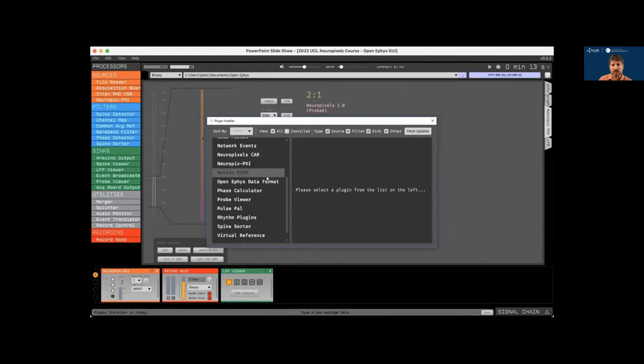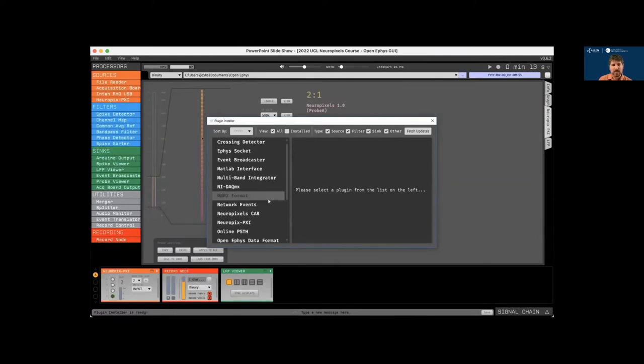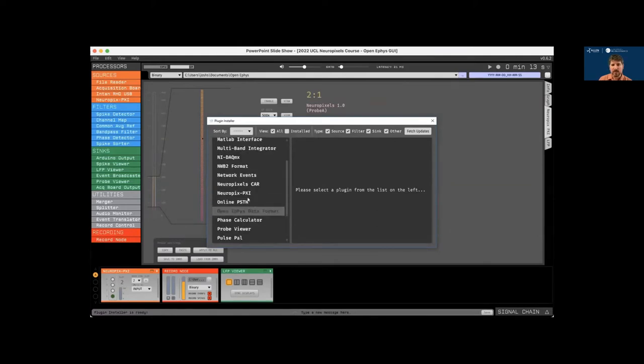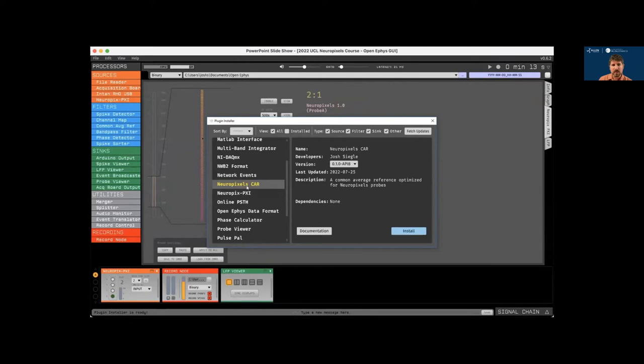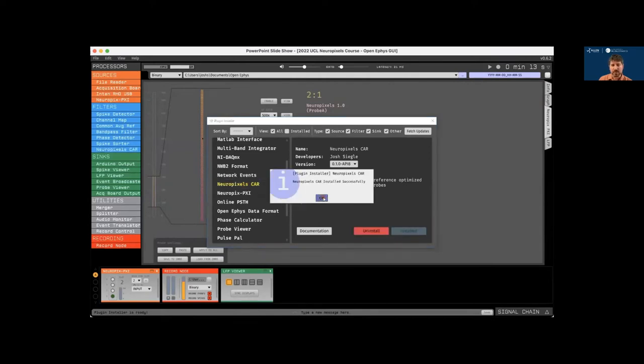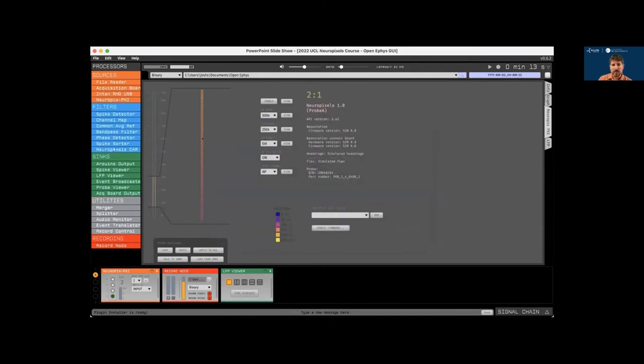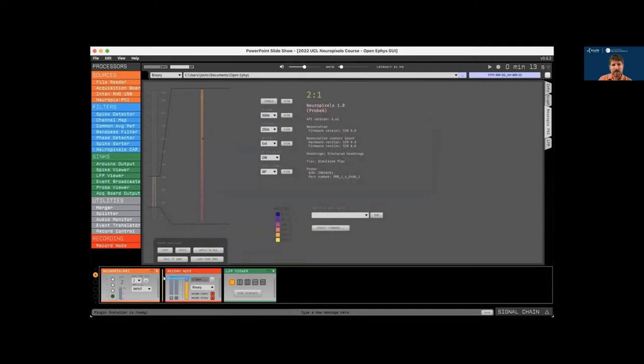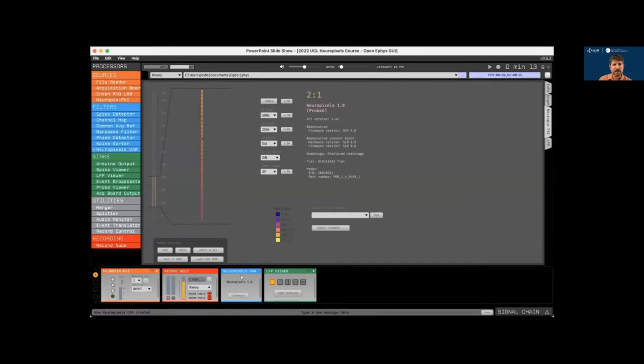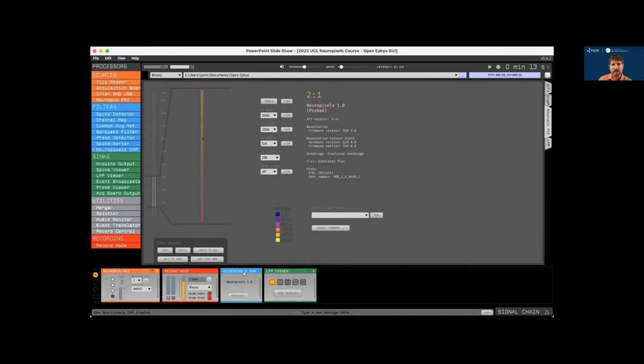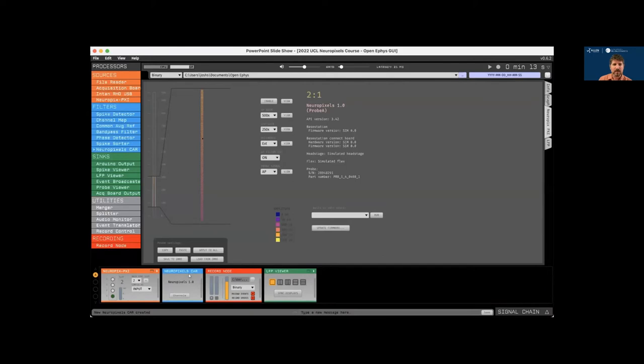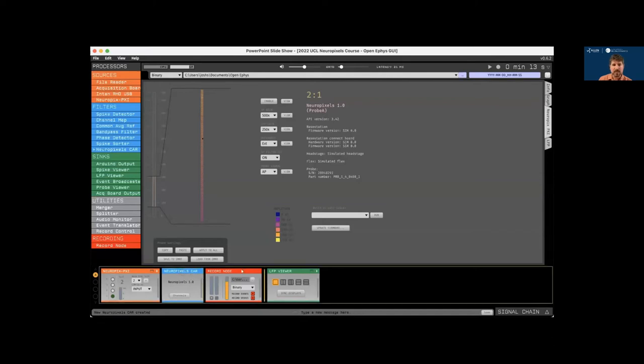This brings up a list of additional plugins that are available to download. So we can scroll through this and then we're going to select the Neuropixels CAR plugin, which is a common average reference that's optimized for use with Neuropixels probes. So we can drop this into the signal chain and it automatically detects the type of probe that's sending it data. So it knows which channels are sampled simultaneously. And it's important to consider the location of this plugin in the signal chain. If it's placed to the right of the record node like it is now, then the common average reference will only affect data that's visualized in the LFP viewer. But if we now place it to the left of the record node, the GUI will save the data after it's been processed by the common average reference.